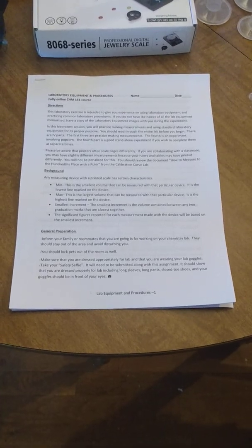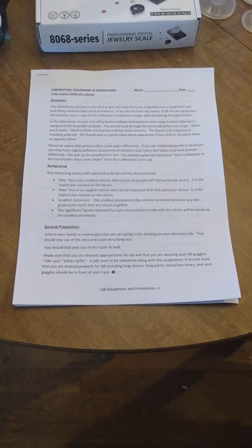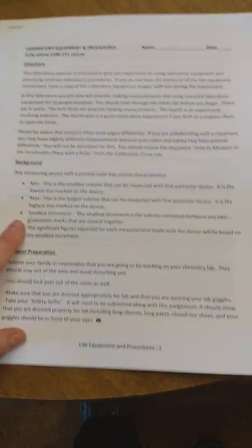Hello, I am making this video to introduce you to some of the contents of your lab kit and to your first lab, which is equipment and procedures. I suggest you print out at least the last page with the rulers and page 4 with this table.